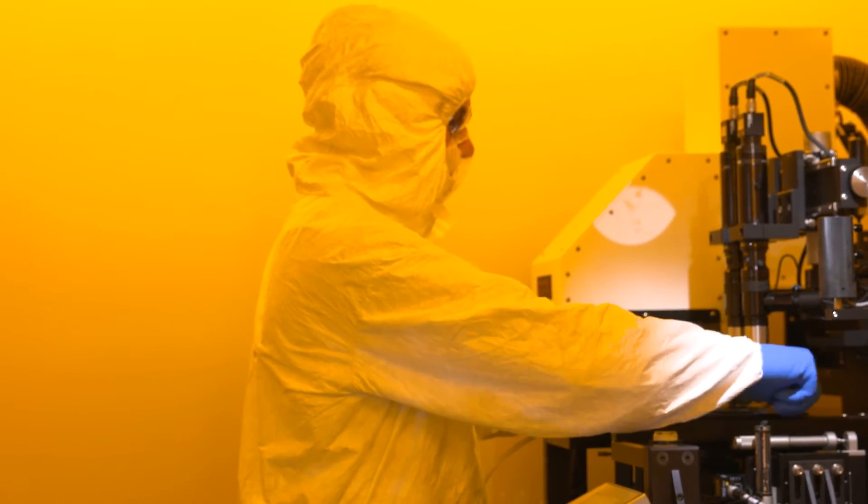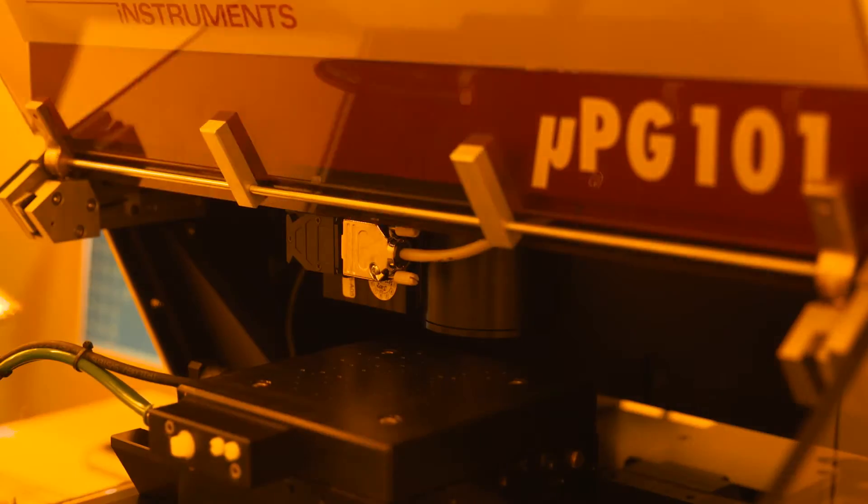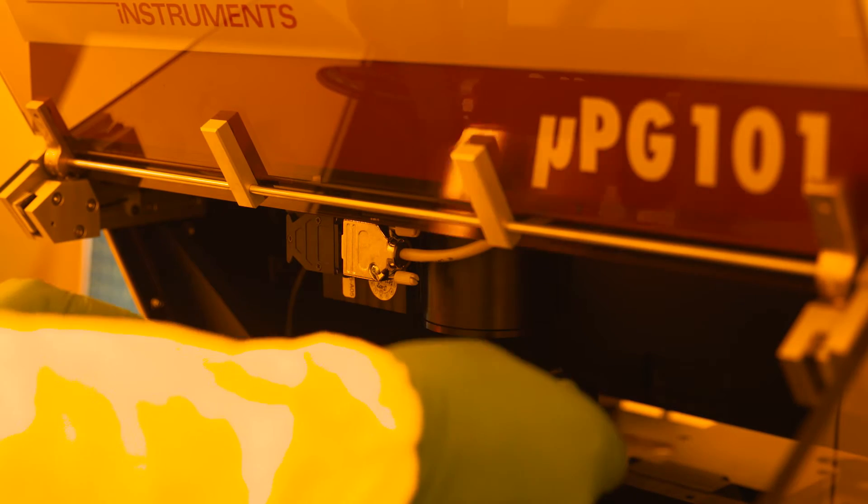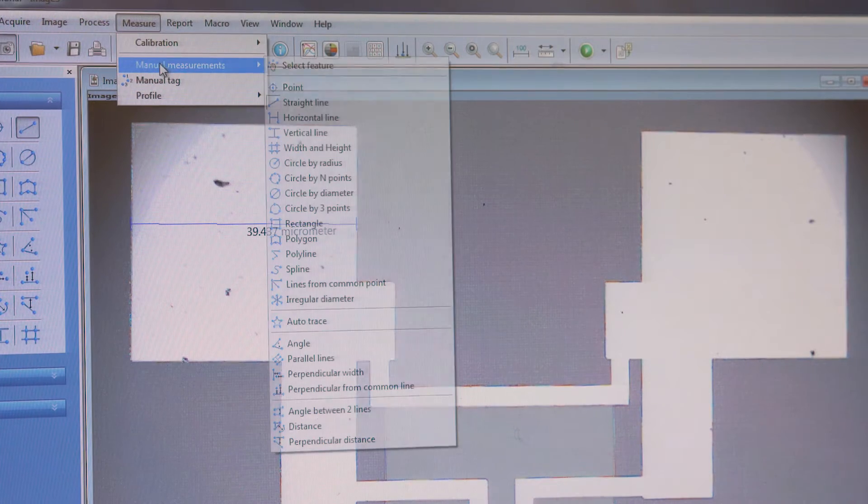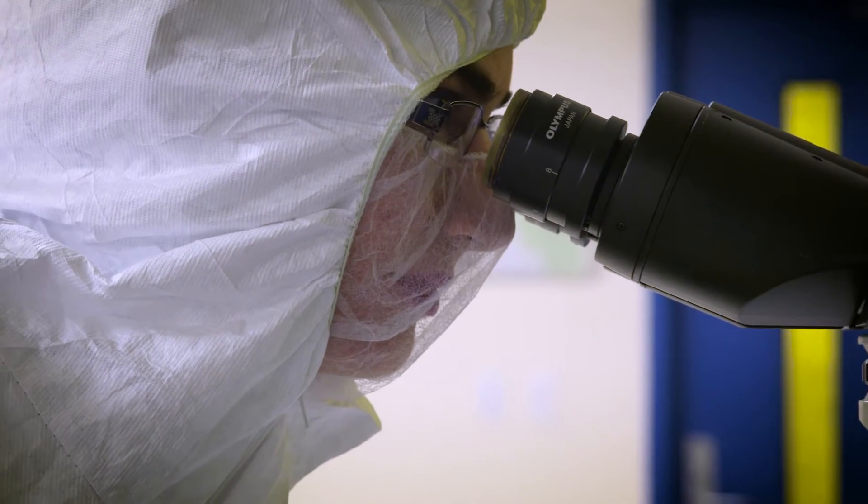Sensors, biosensors, micro devices, filters, micro batteries and micro supercapacitors can all be developed, batch processed and analyzed within the laboratory's clean environment.